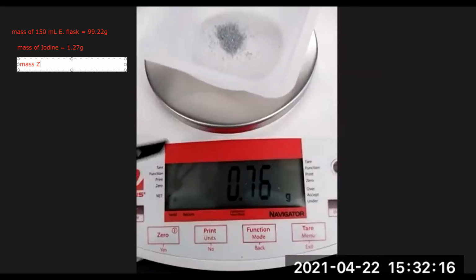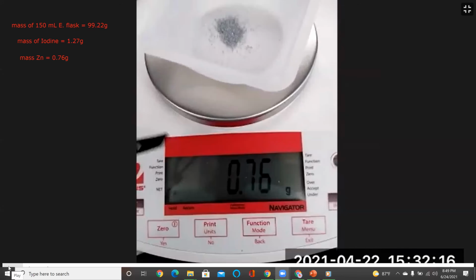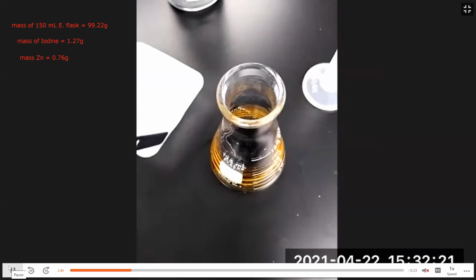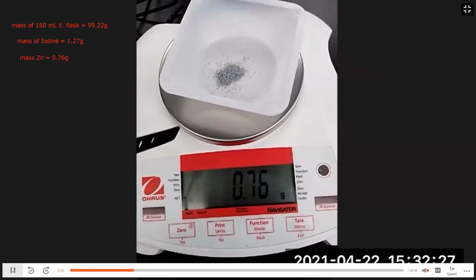mass of zinc, 0.76 grams. Now we're going to add it into the Erlenmeyer flask, mix it a little bit, and then we're going to heat the flask.